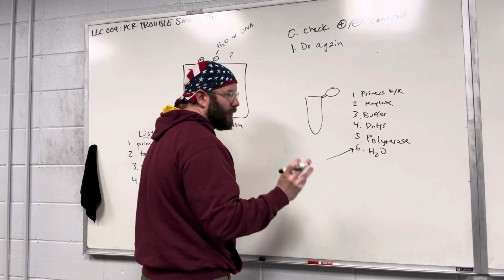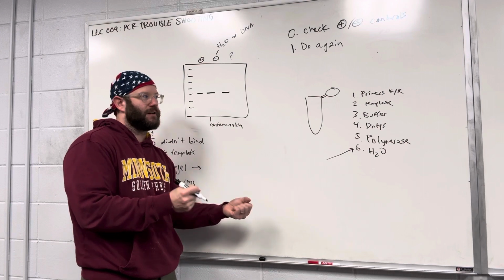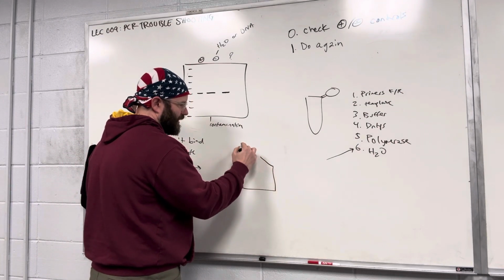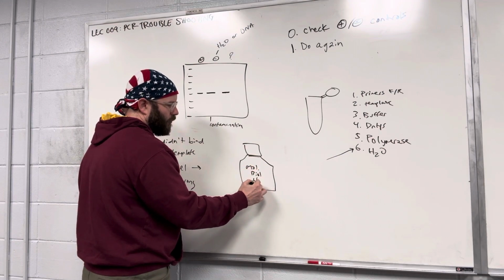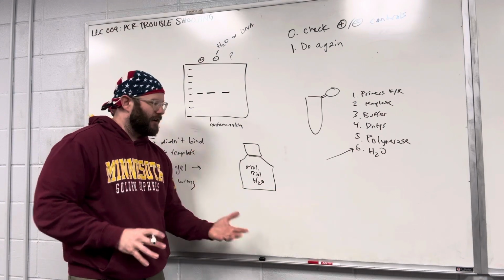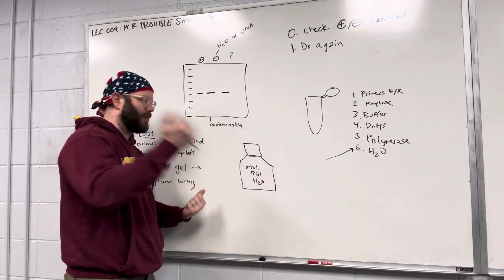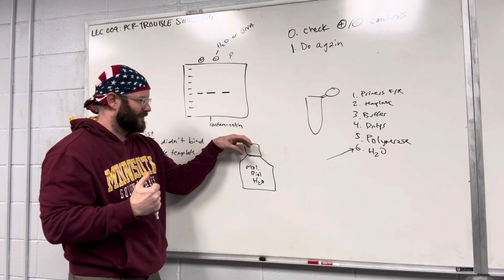Water is the most common thing. When you are running PCRs, you'll typically have a special water at your station. That water usually comes as molecular biology grade water in a container like this. One thing you never want to do when running PCRs or doing molecular biology in general is open the cap of this big jug, take your pipette, take water out, close the cap, and put it in your PCR.